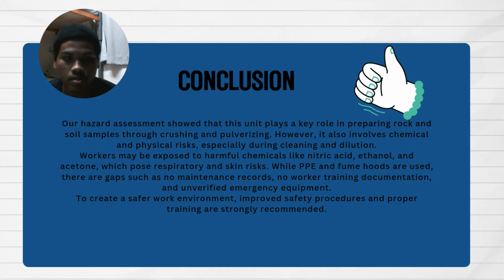In conclusion, this unit plays a key role in sample preparation. However, it involves risks like chemical hazard and lack of proper safety records. Although PPE and fume hoods are used, there are still gaps such as unverified emergency tools. We recommend improving safety procedures and providing proper training for all staff.